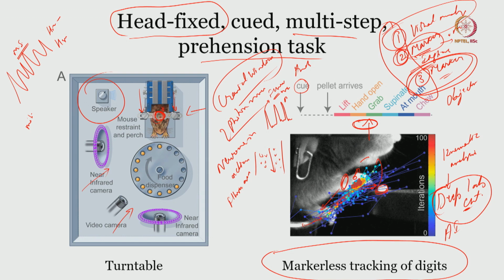Your analysis should also match the efficiency of the camera. That is where automated software and AI algorithms make a huge difference in objective analysis, and you can easily synchronize the digit movement along with the neural signal.